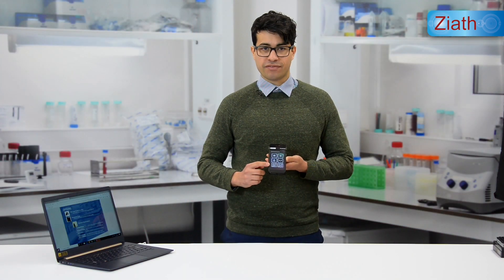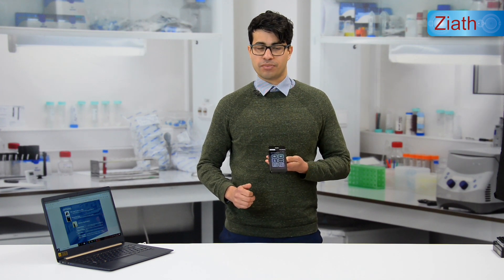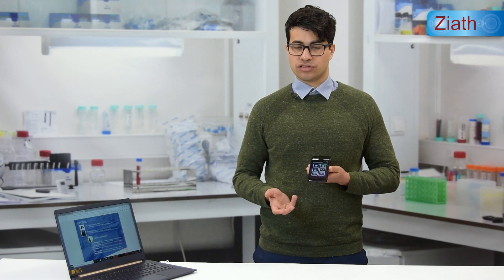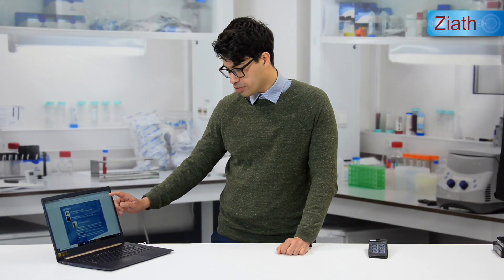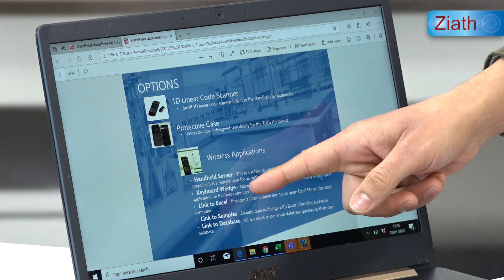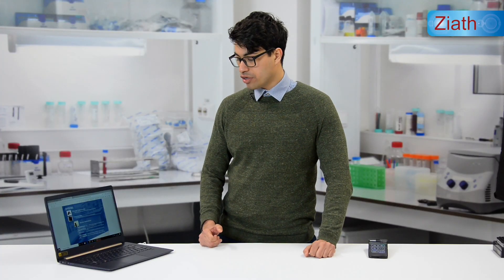The application in the bottom left is the handheld server, which is an optional extra that must be purchased separately. Once the handheld server is purchased, you can buy additional optional extras for the device, all purchased separately, which are shown on screen here. The wireless keyboard wedge function wirelessly transmits the barcode scanned on the handheld into an open online application — the same as the keyboard wedge previously shown, but this time it does not need a connection to a computer. You can carry the handheld anywhere on site, scan a barcode at the freezer, and wirelessly transmit it to the open application on the computer.